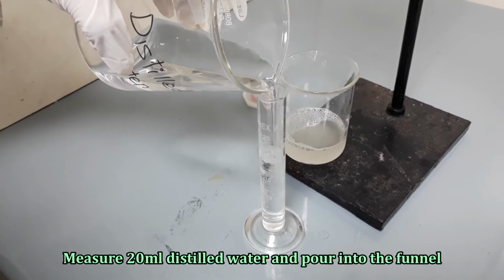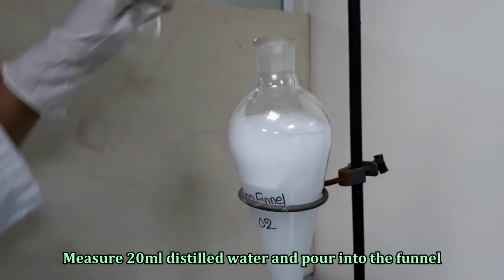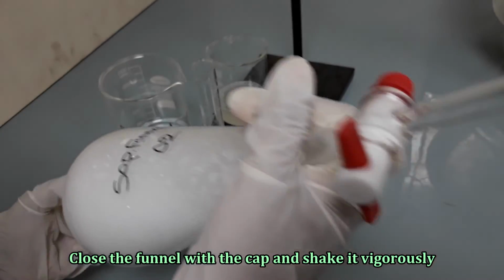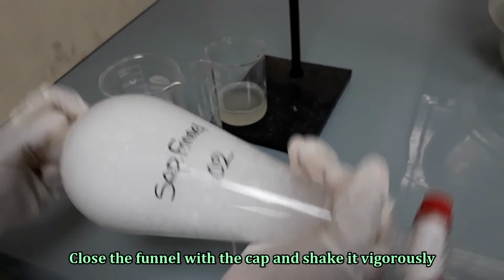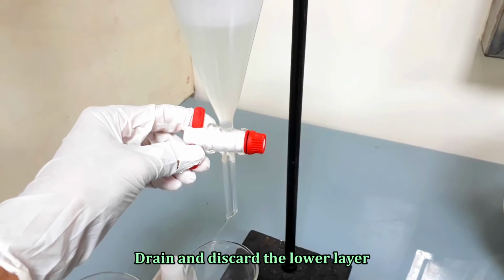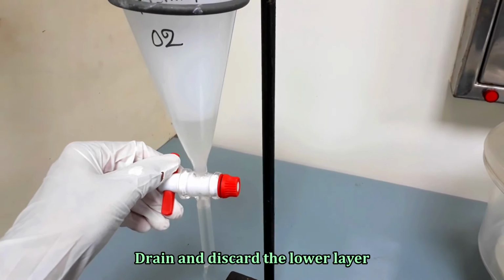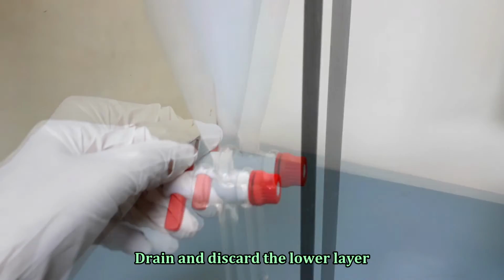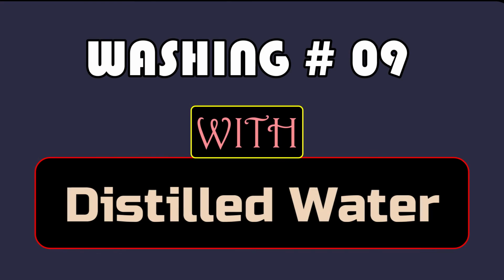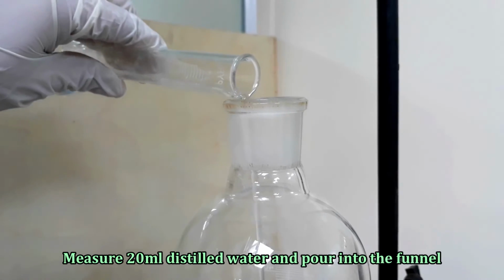Wash with distilled water again as done previously. Wash with distilled water again as done previously.